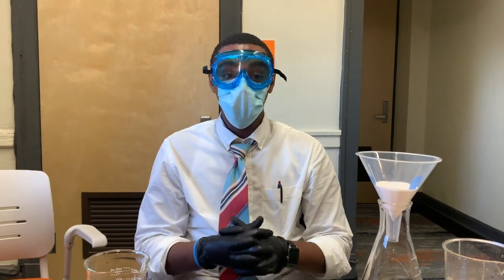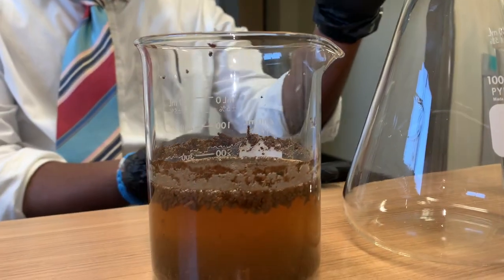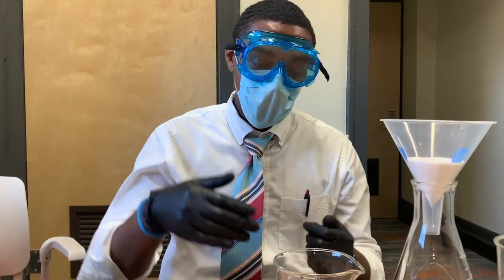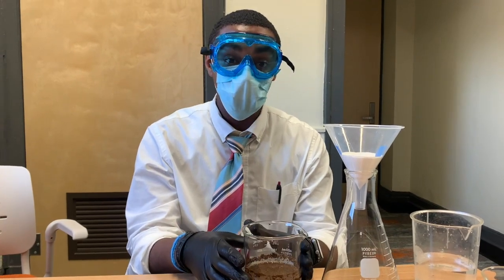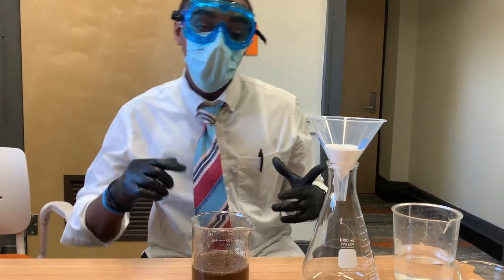And what we have here is a beaker with a filtration system. And inside this beaker is some water and some gravel, right? Mix it up really nice. And our job is to try to separate the gravel from the water. Okay? Now I want to turn your attention to the actual filter.